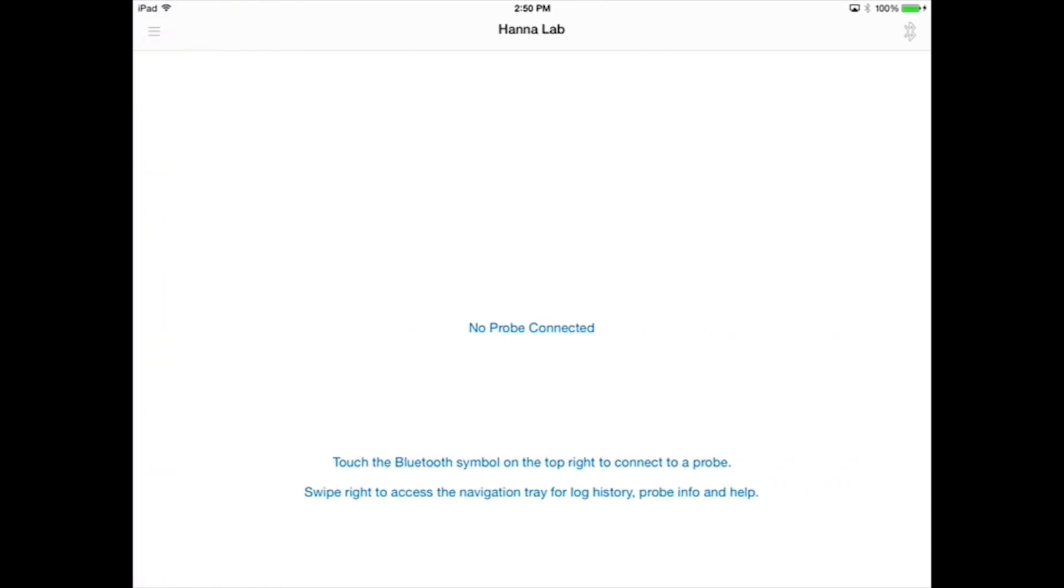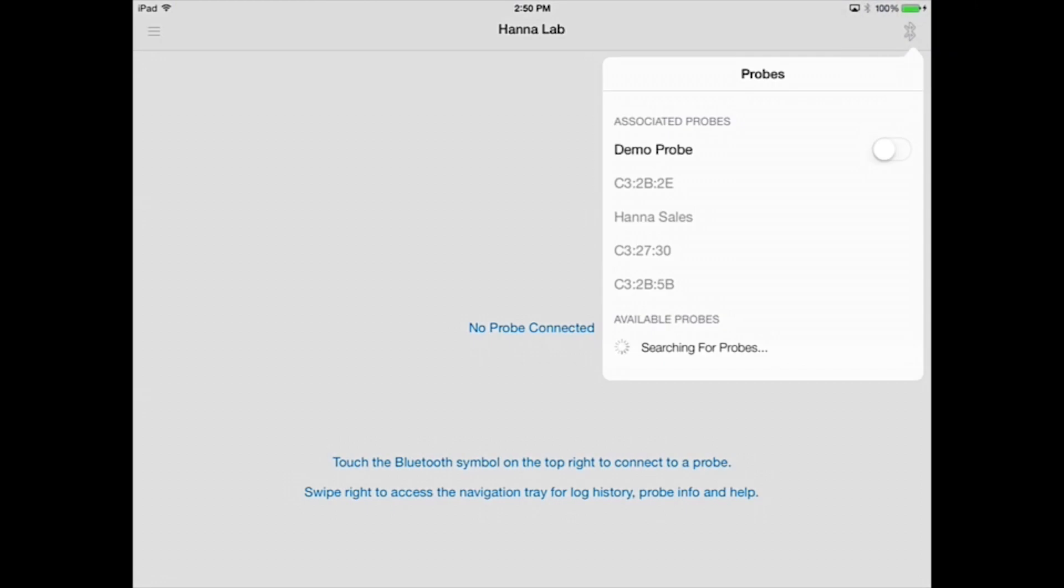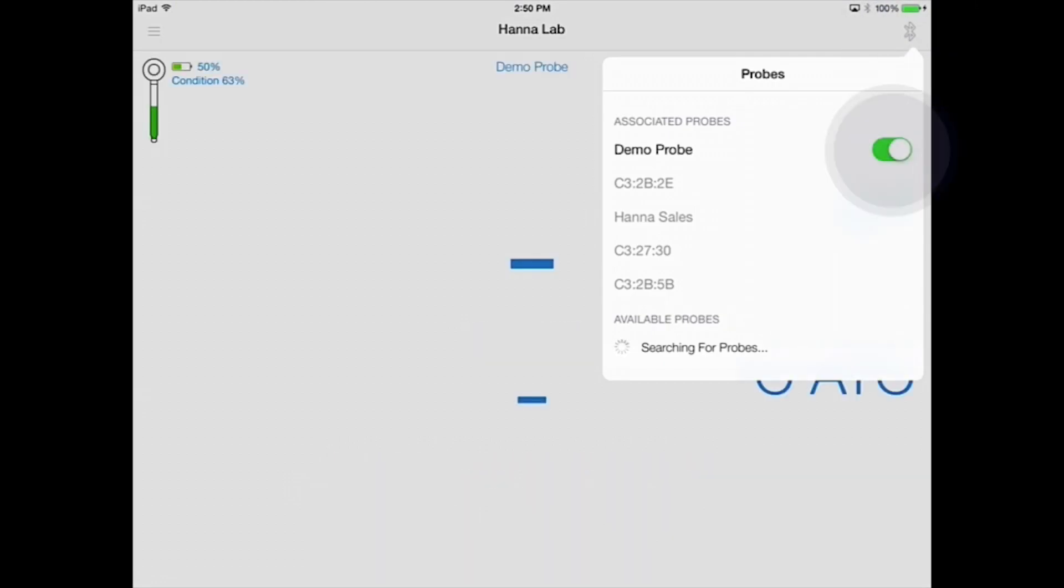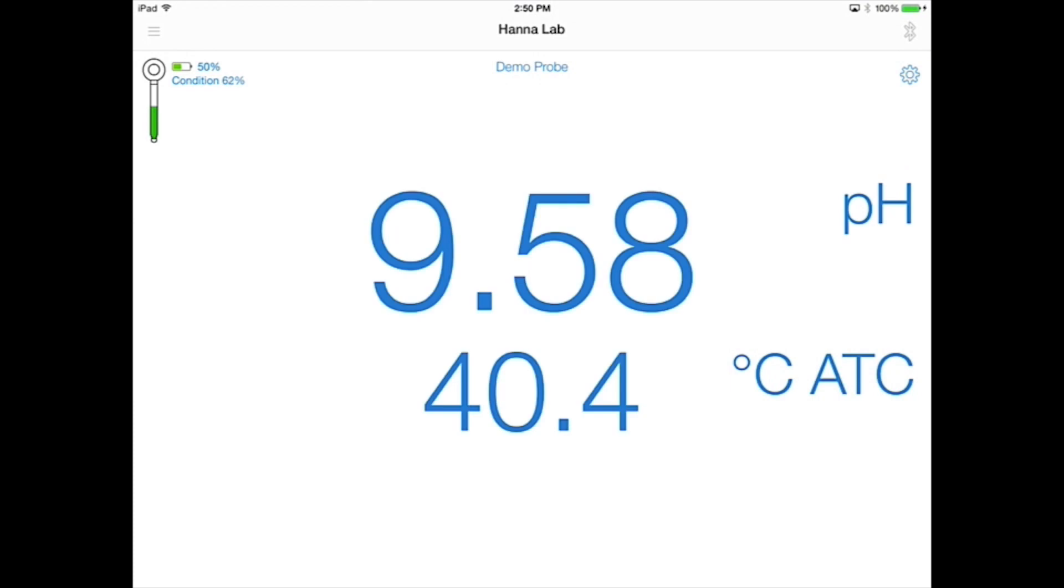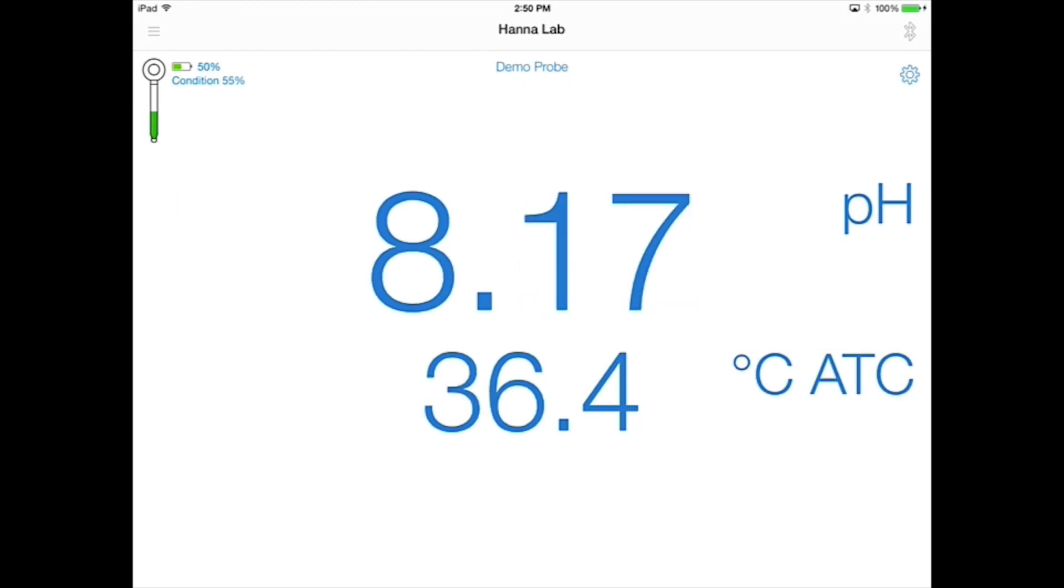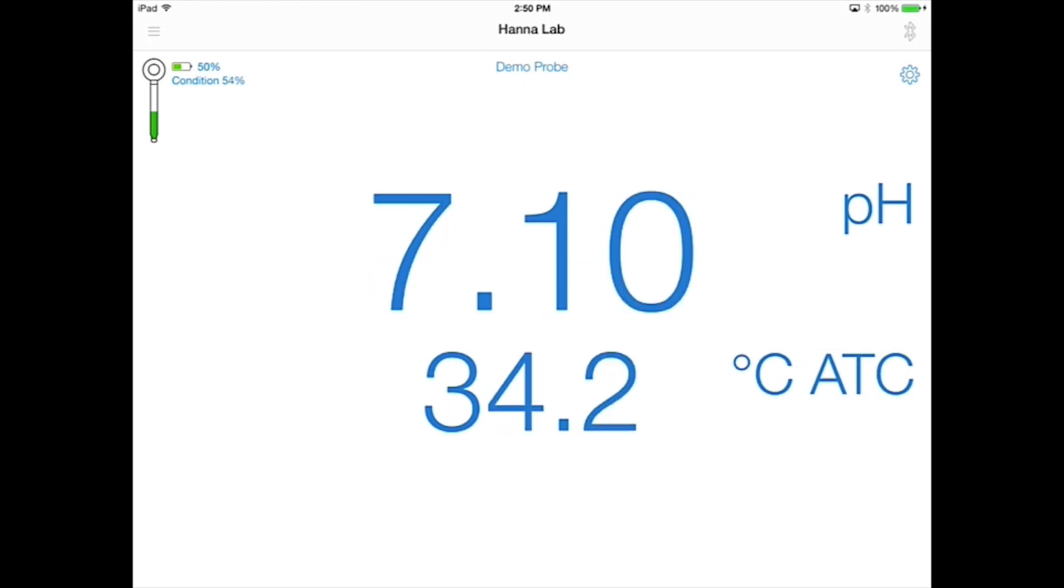You'll see there is no probe connected. Touch the Bluetooth symbol on the top right to connect the probe. If you don't have a probe set up, select the demo probe. We'll show you how to connect an actual probe a little later. The demo probe is a great way to explore the HANA Lab App. While using the demo probe, all features are functional, including a calibration simulation. The basic measurement screen will appear.